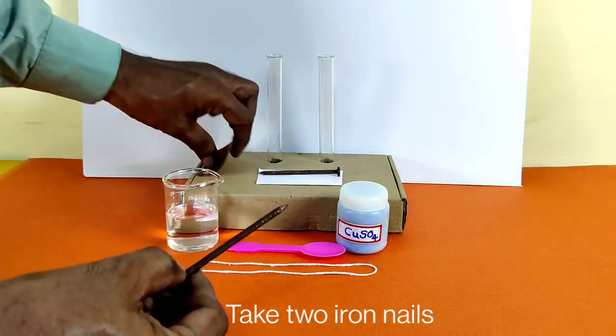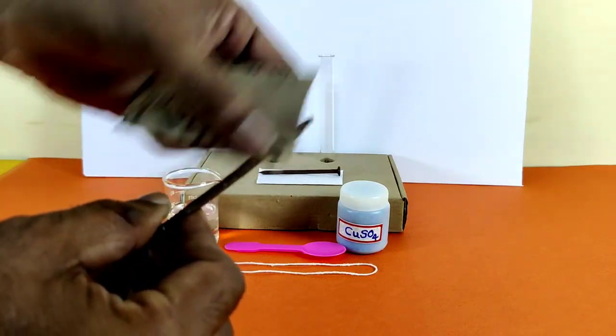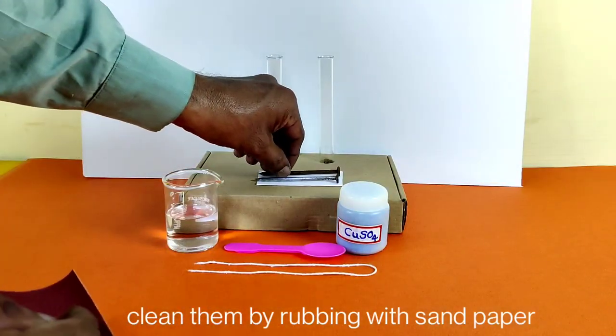Take two iron nails and clean them by rubbing with sandpaper.